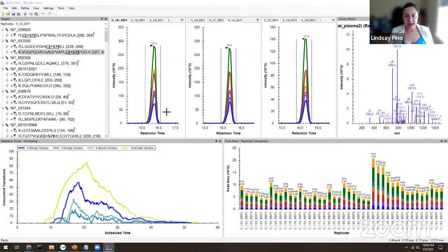And now in Skyline, if you use inserted protein peptide instead of library, can you still view the spectra? Only if you already have the library set up. You could insert a peptide and it would associate that. But if you don't have the library set up, Skyline will not make up a spectra for you.